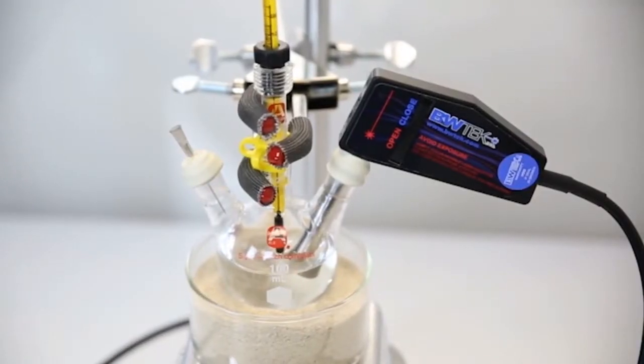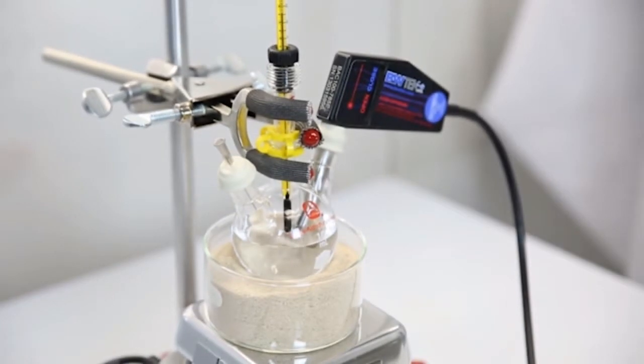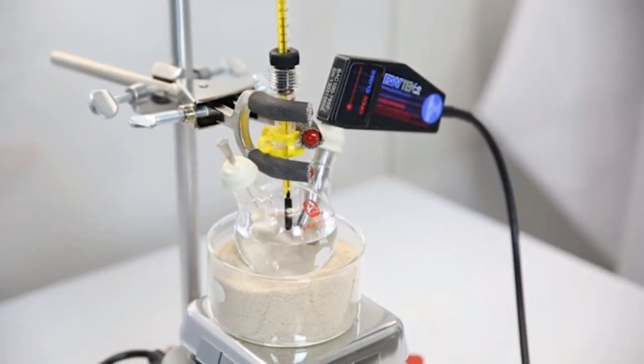In this setup, we are using a three-neck round-bottom flask, allowing for temperature monitoring, a relief valve for pressure stabilization, and our fiber optic probe coupled to an immersion shaft for in-situ measurements.